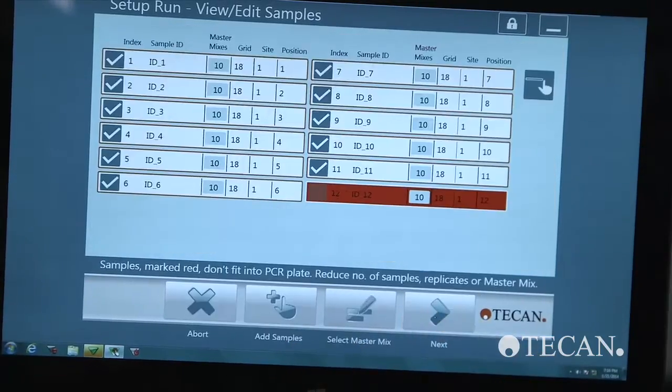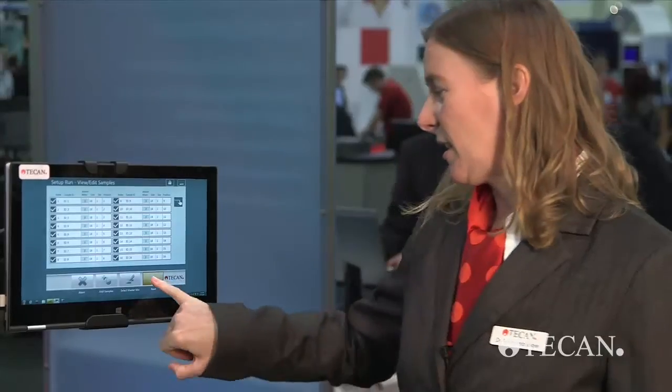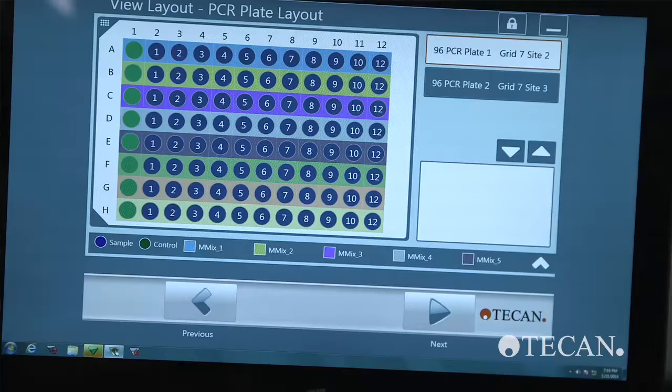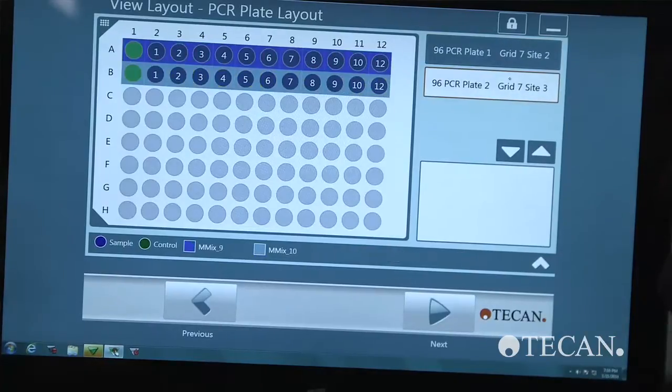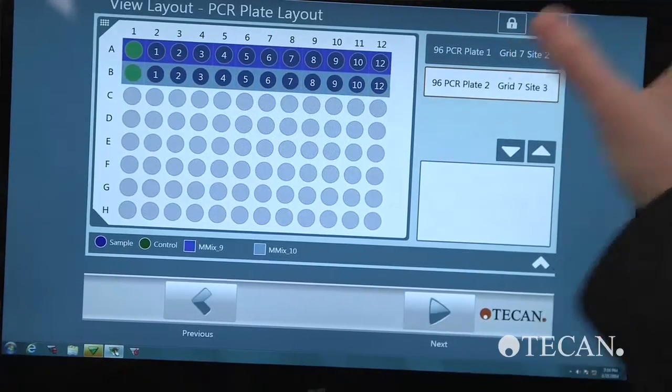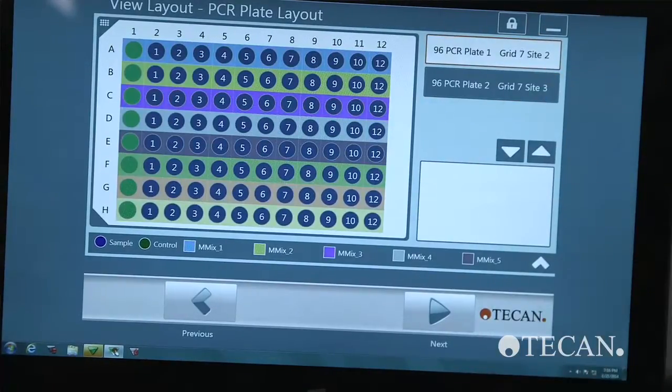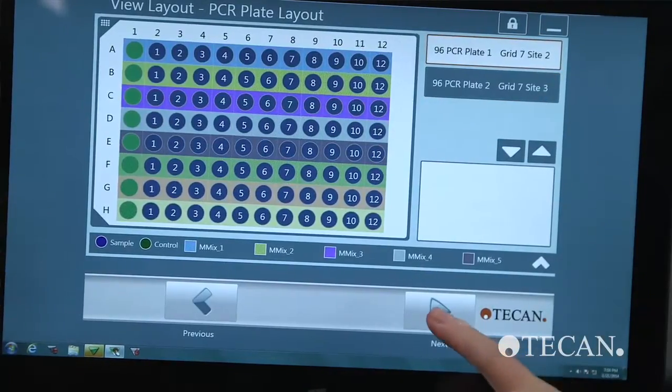And once you are done, you proceed to the plate layout. If everything looks good, you can continue to the next screen to load the work table.